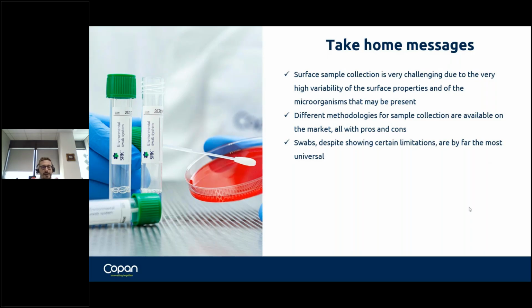And in the case of microorganisms, you can analyze by different technologies, culture, PCR, or whatever, and it also allows you to choose the right volume of solution to apply different culture technologies. Clearly, not all swabs are equal. There are swabs that perform better and swabs that perform less well. It's very important to know the performance of what I'm using.